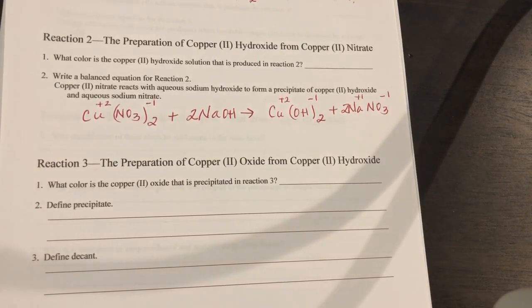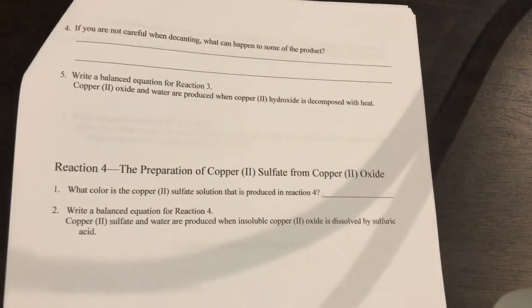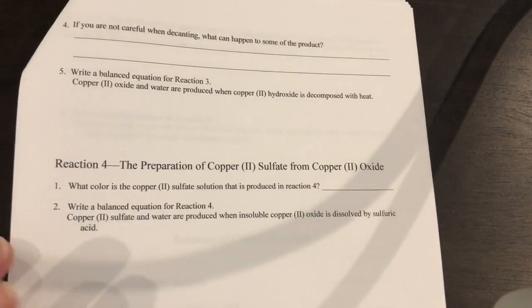Okay, so what color is the copper 2 oxide that's formed in reaction 3? We said it was a dark brown. Precipitate, decant, that's all in your lab that you can define. If you're not careful when decanting, what can happen? You can pour the product down the drain. Okay, let's go through the reaction.